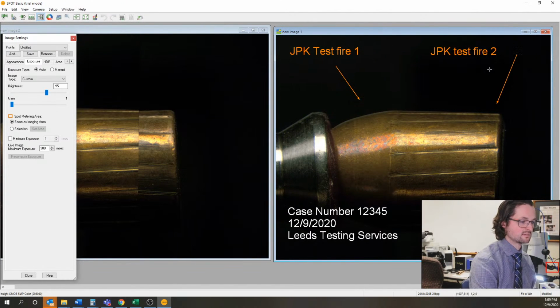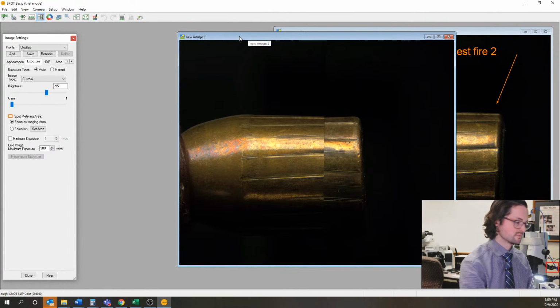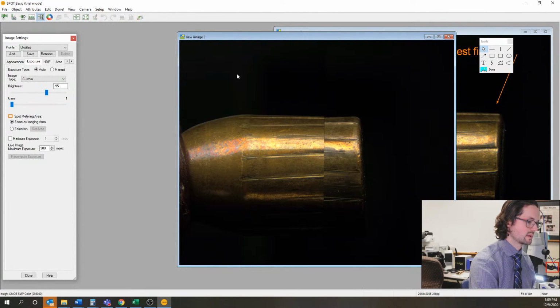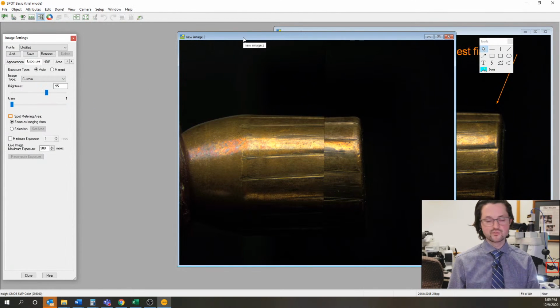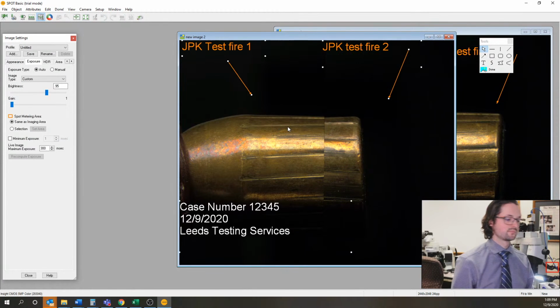And then click Done. And then you can go to your new picture that we just captured, and you go to Edit, you go to Annotate, and you can click Control-V, or you can just right-click and go to Paste. And then it pastes all your annotations directly on your picture, and now you can make movements.